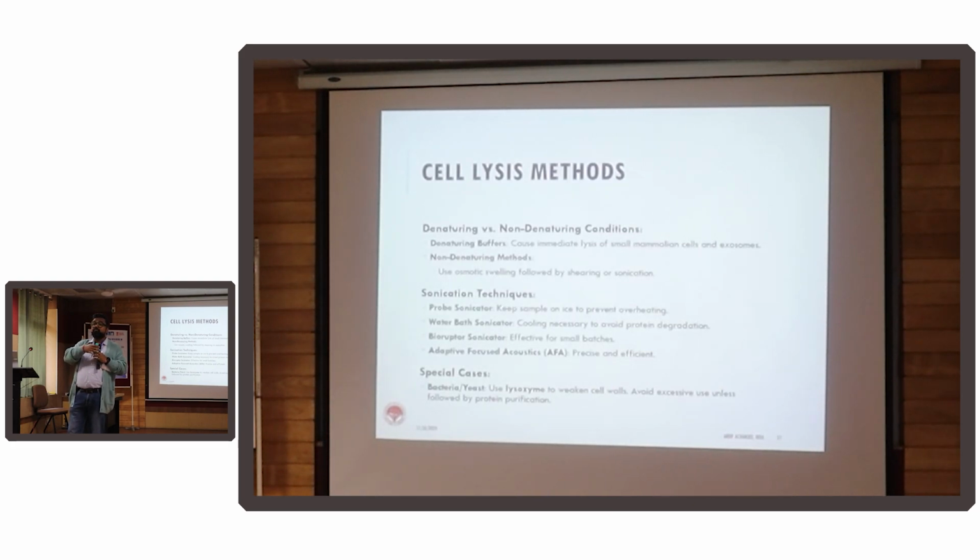So remember, when you are planning these sample prep techniques, the reason we are having a 2-hour lecture on sample prep is that everything is contingent on your sample prep. You cannot blame the mass spec center that they give you wrong data. They will give you a huge peak of lysozyme, and that peak is so high in dynamic range that the rest of your effective molecules that were actually running the game are masked. It's just like a huge fog cover, and now your flight cannot land because it cannot see the runway. So be very cautious when designing your experiments.